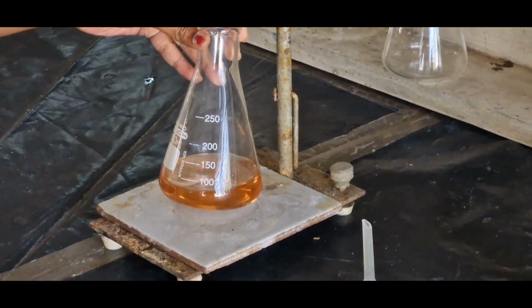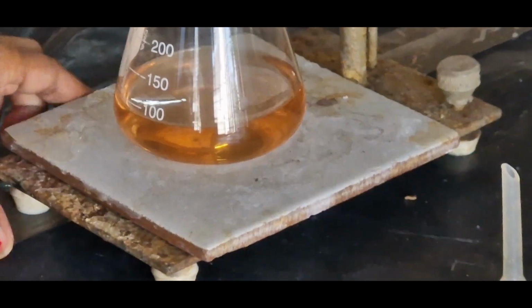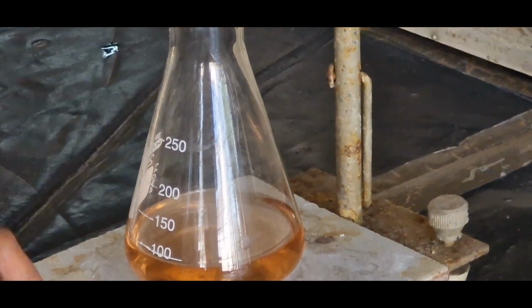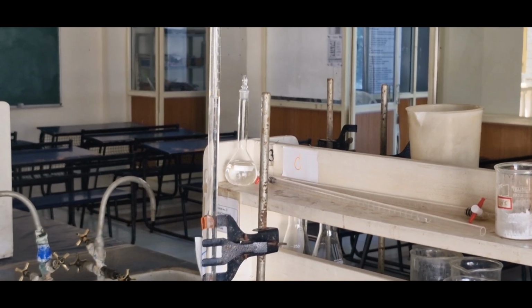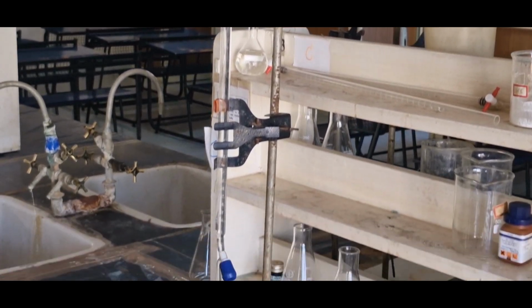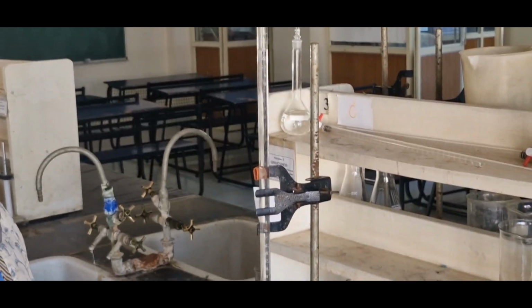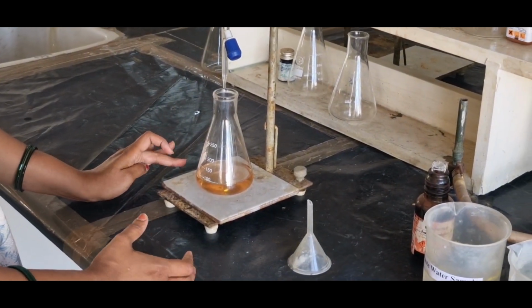The color has changed to reddish brown. So this is the end point of the titration. The further calculation will be discussed next. Now note down the burette reading and take it as the back titration reading. Repeat the same procedure 2 more times to get the concordant readings.